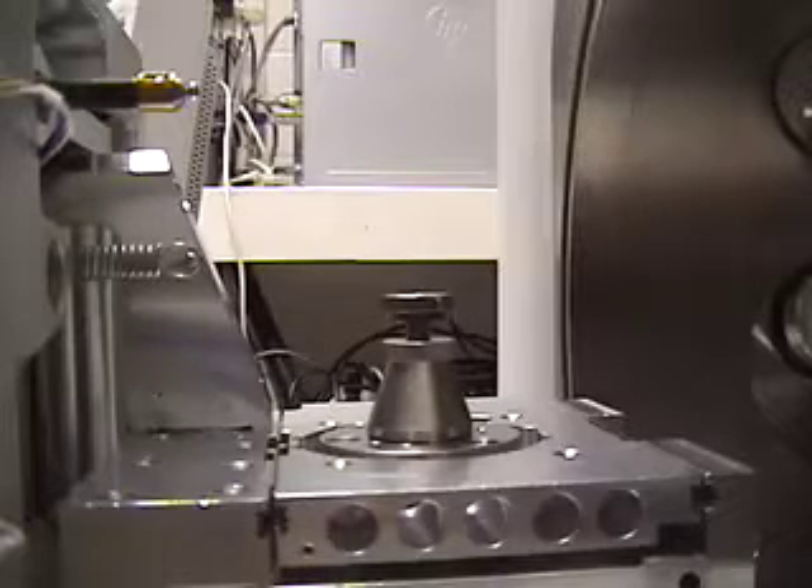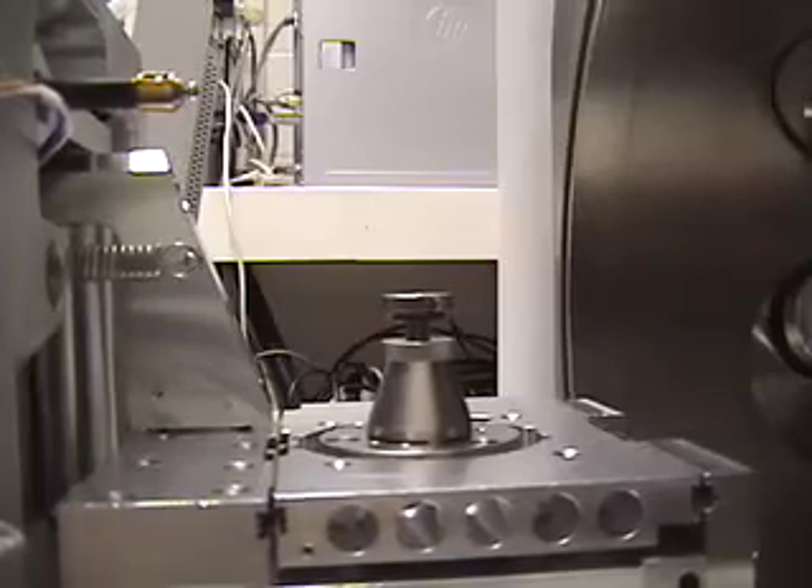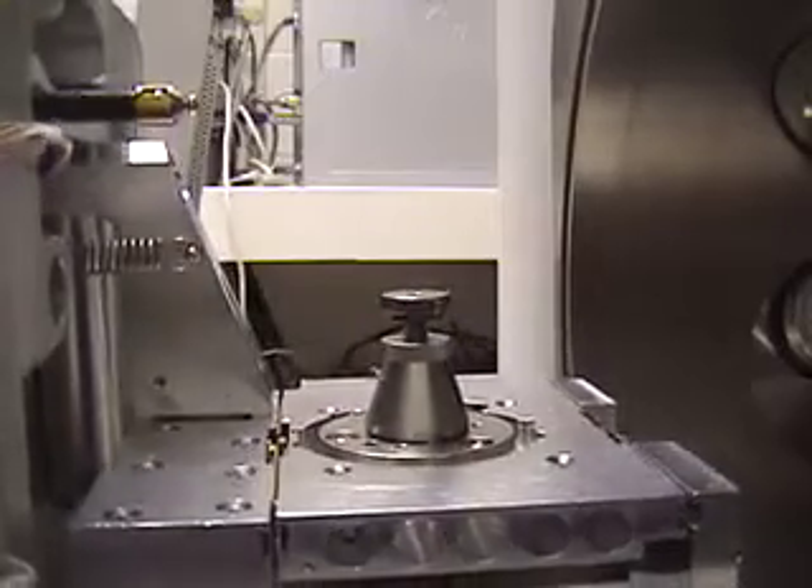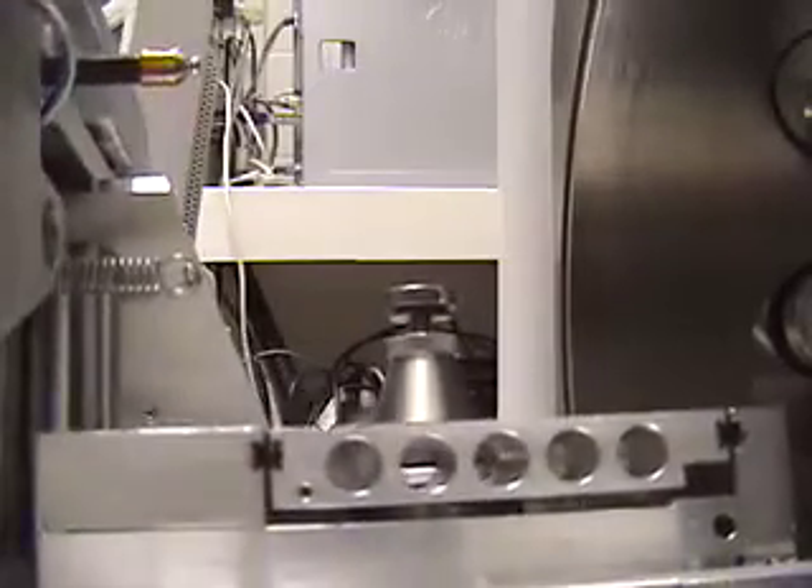Here is a demonstration of the stage being tilted. It can tilt 10 degrees in one direction and nearly 80 degrees in the opposite direction.